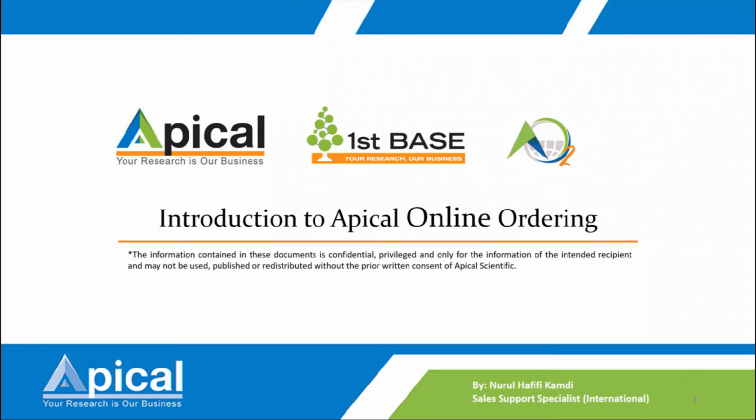Please, I have a question about SNPs, single nucleotide polymorphisms. I just received my sequencing result last week, and that is one of the things I want to do. Currently, I have two different sets of microorganisms whose sequences need to be aligned and compared to know the regions of polymorphisms, if any. I want expert advice about that, including the software to be used and how to go about it, please.